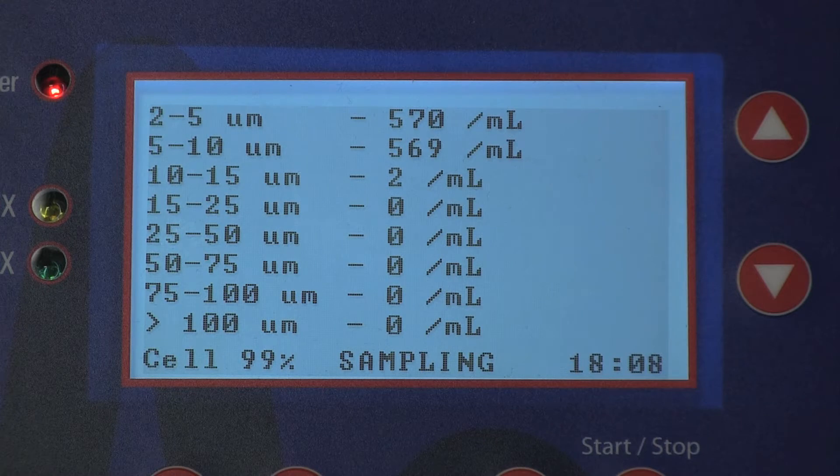It should be noted that in the calibration process, half of the particle concentration will appear in the lower particle size range and the other half in the upper size range.